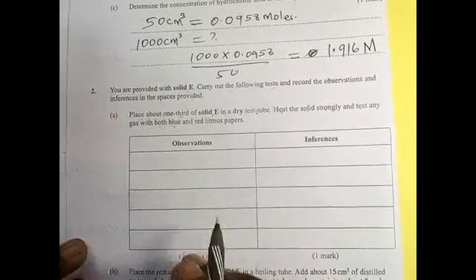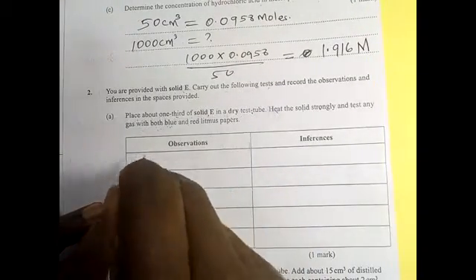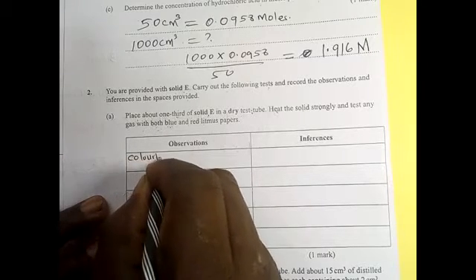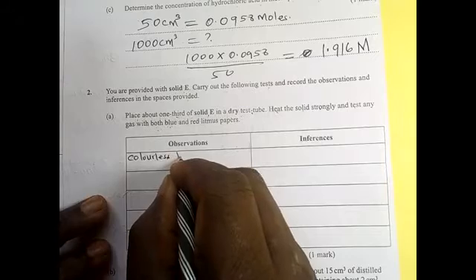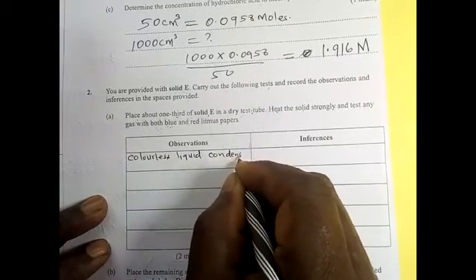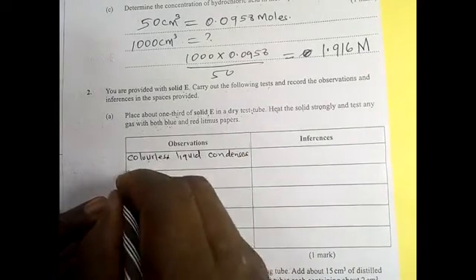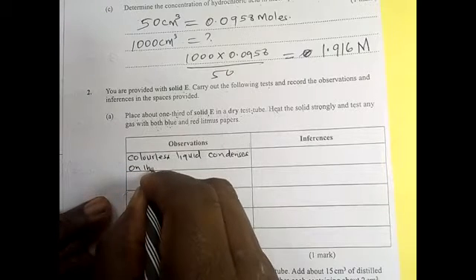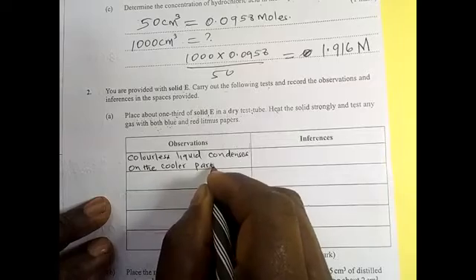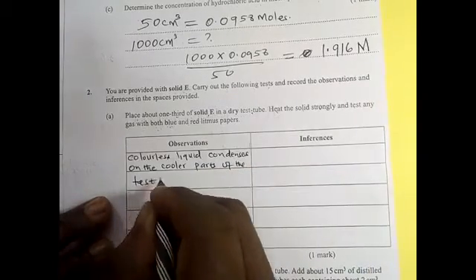So the observation is there. When you heat a solid, you expect the following observation. So this was the observation made: colorless liquid condenses on the cooler parts of the test tube.